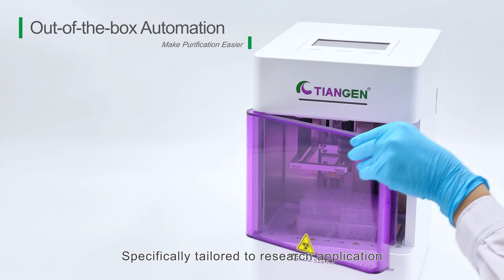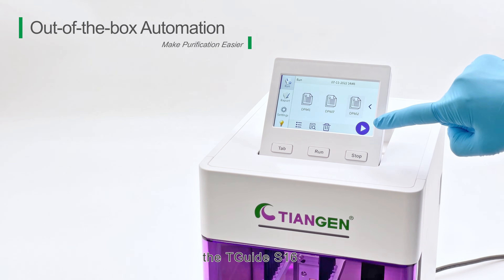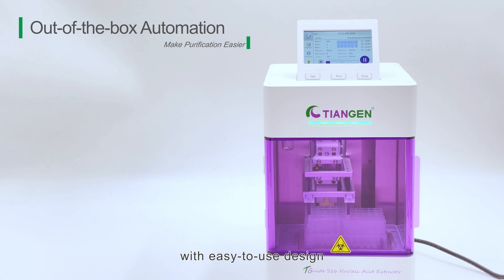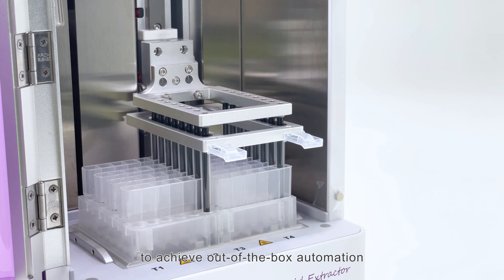Specifically tailored to research applications, the TGUIDE S16 combines a pre-installed program with easy-to-use design to achieve out-of-the-box automation.